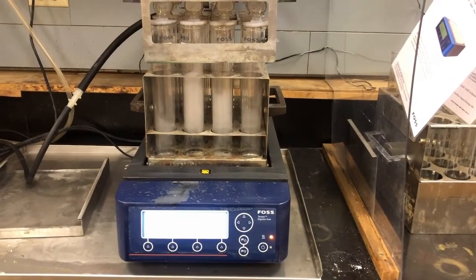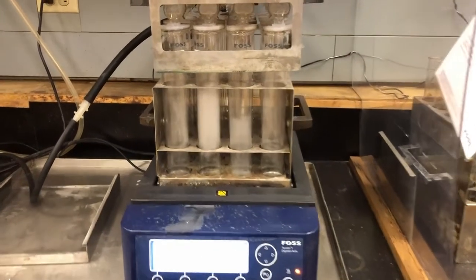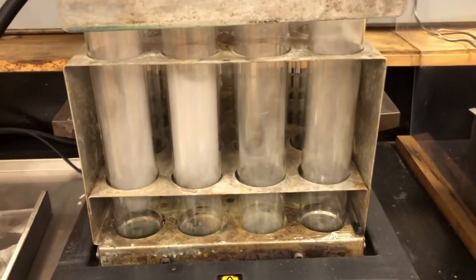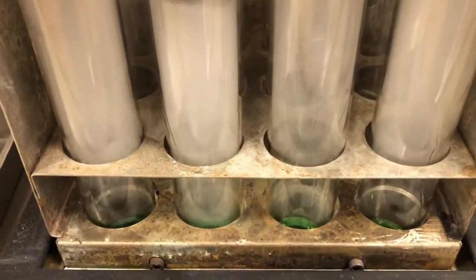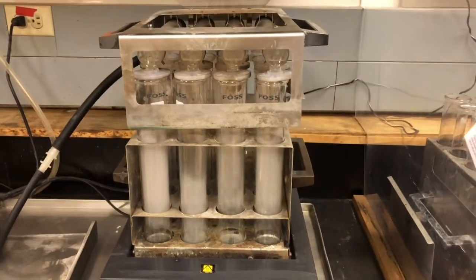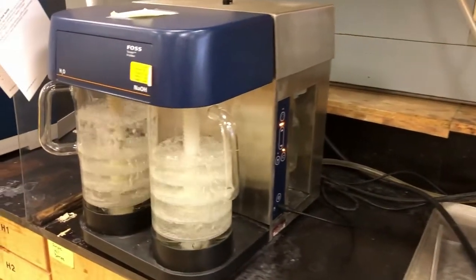So our digestion block has been running now for about 30 minutes, and you can really see now those vapors that I mentioned. You can see that the samples are giving out a lot of vapors. You can't really see the samples, you can see them a little bit. You'll see those better when I can take them out. So the scrubber is working now. Scroll over, you can see it's bubbling away.